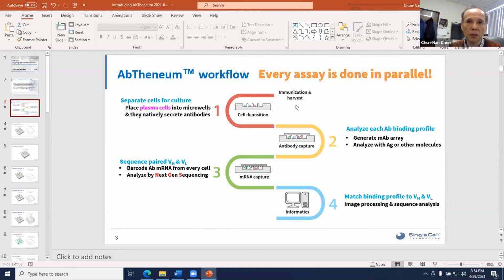So in a sense, if you have it in, for example, phage, I presume you can put the individual phage there instead of the cells here. But I guess there's the bacteria that deals with the phage, because we want to be able to capture the antibody from that.